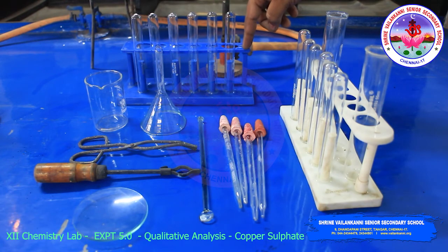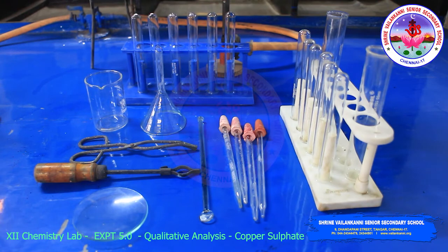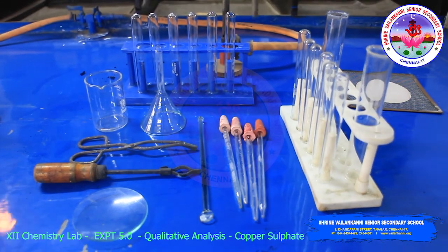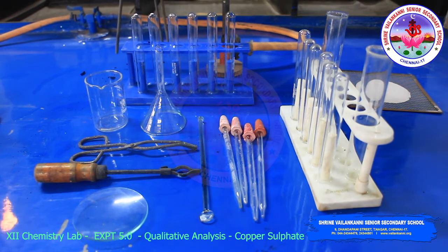This is a test tube stand, test tubes and boiling tubes, wire gauze, the tripod stand, then the Bunsen burner. Now we will do the experiment.